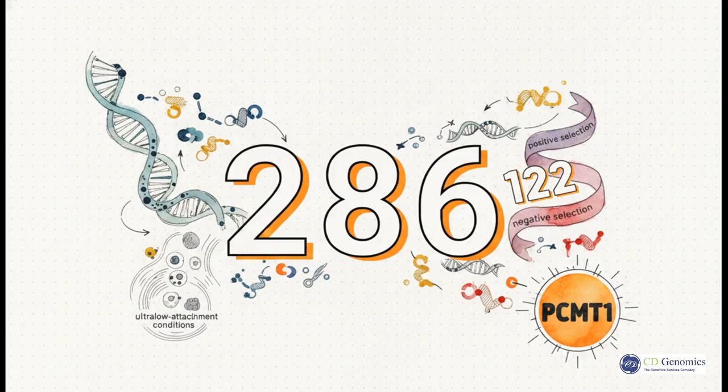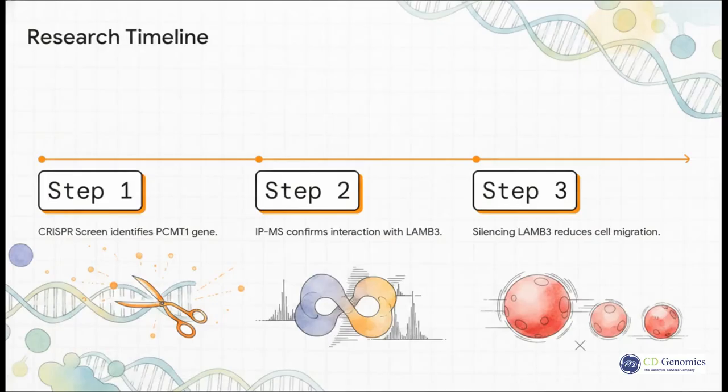Following this screening under both standard and ultra-low attachment conditions, the high-throughput sequencing data came back, and it was staggering. It pinpointed exactly 286 genes from negative selection and 122 genes from positive selection that were directly involved. And while the screen successfully found some known resistance genes, it really shined a massive spotlight on one specific, critical target, the PCMT1 gene. And this brilliantly illustrates how a CRISPR screening pipeline uncovers direct causal relationships.